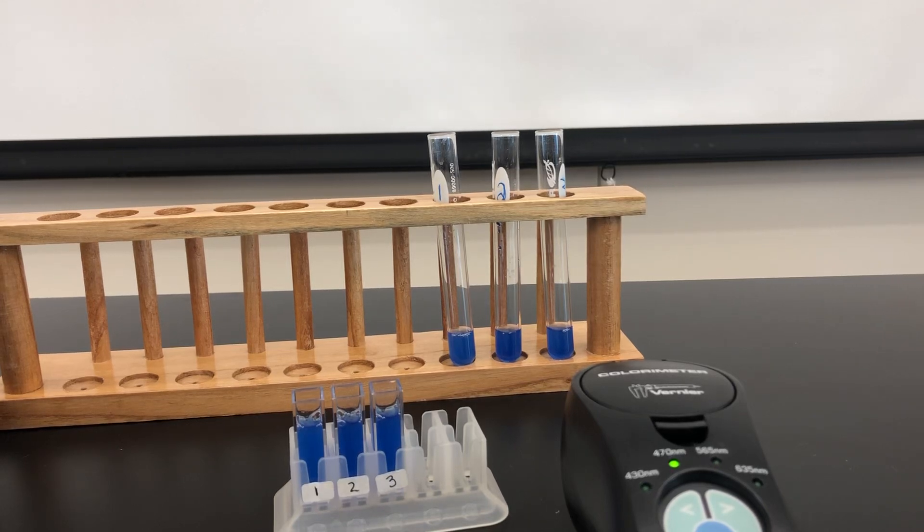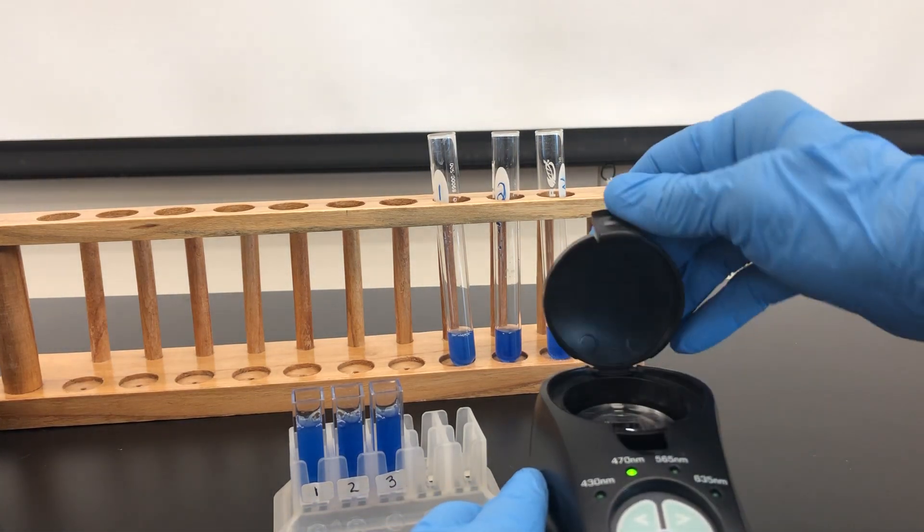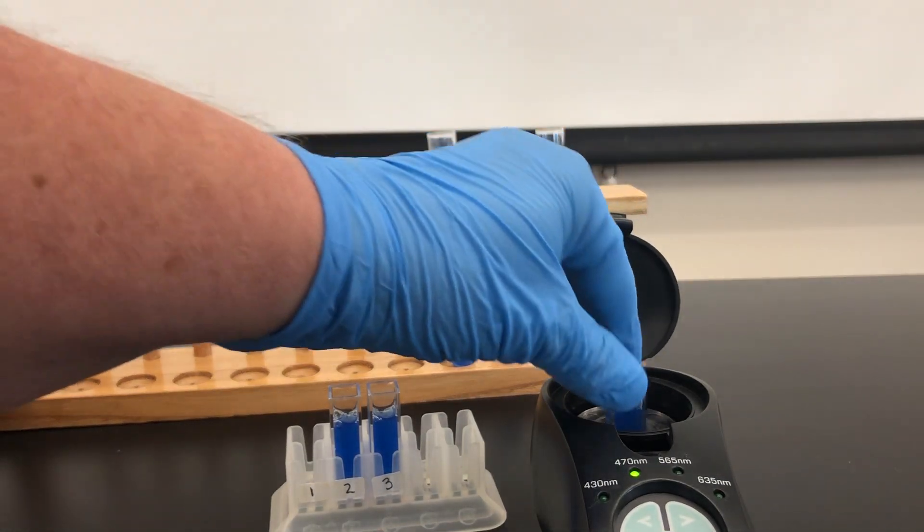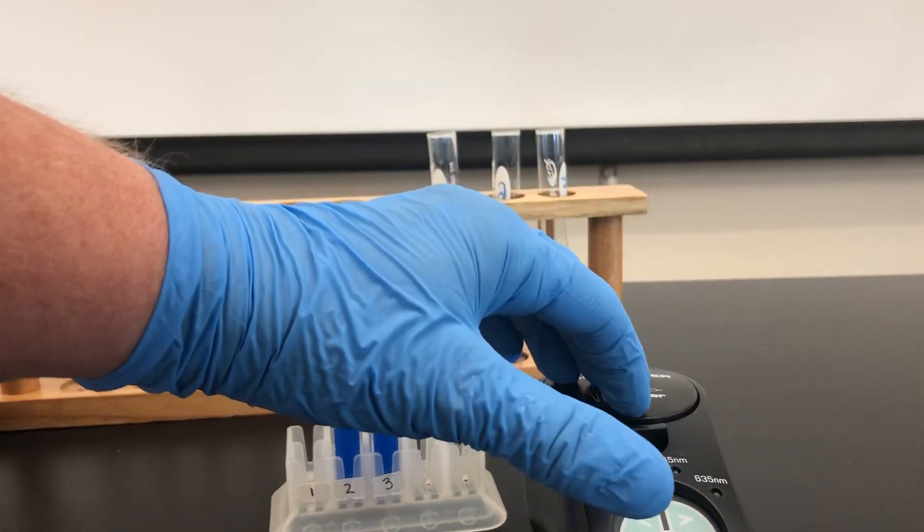It's been five minutes. Let's check our next readings. Remember, we're going to do each one in the colorimeter in the correct orientation so light can penetrate through or absorb.